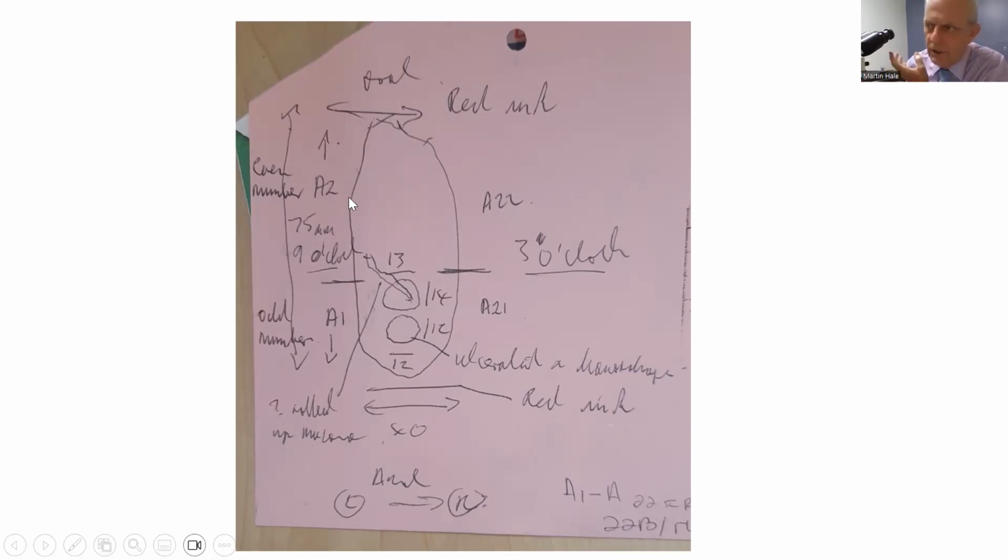So I don't put it into a Swiss roll because I don't want to disturb any of the anatomy. You see that I've measured the size of the tumors, these nodules, 13 by 14, and then 12 by 12. Notice that I've said that this one is ulcerated and hemorrhagic, so I know exactly where I am when I read the sections. And here I put A1 and A2, and that refers to my blocks. And then on the other side, because I've breadloafed it and taken my sections from left to right, on the other end I've got A21 and A22.